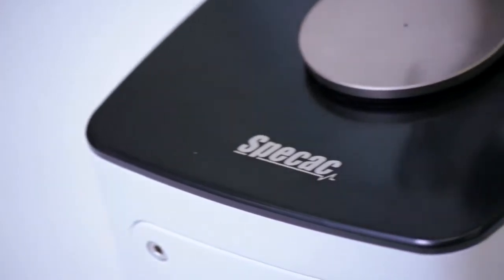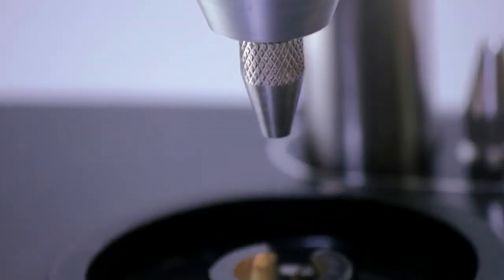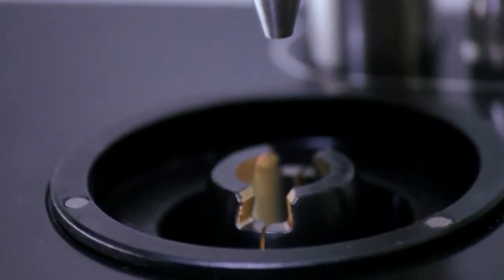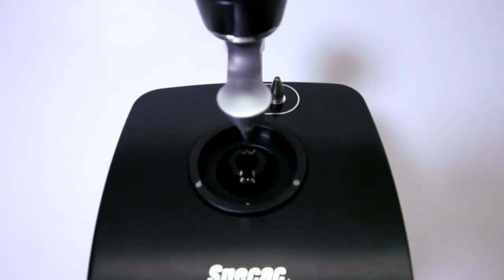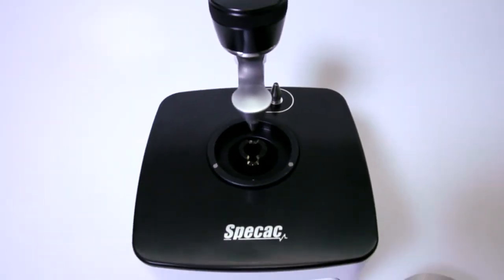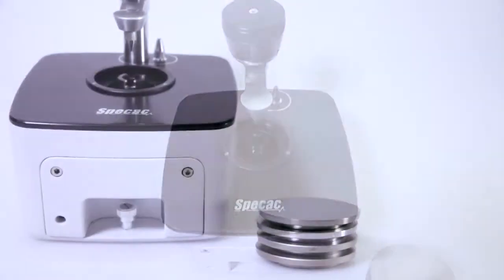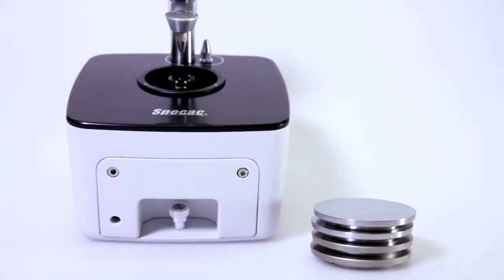The Quest ATR accessory is a high-performance single-reflection ATR accessory from SPECAC, designed for routine laboratory quantitative and qualitative analysis of solids, powders, liquid space and gum-like samples.